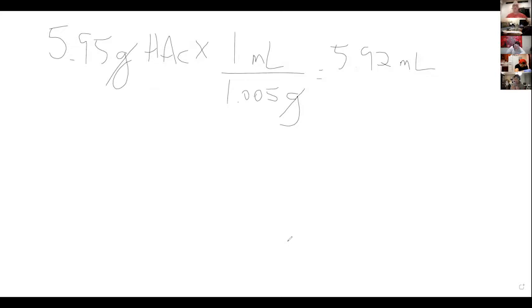So now I compare that to my volume of sodium hydroxide. My initial volume was 10.0 mL, and my final was 5.0 mL. So I delivered 5.0 mL, 1 molar. Sorry, 1 molar.